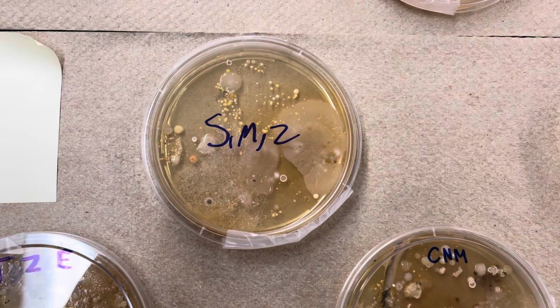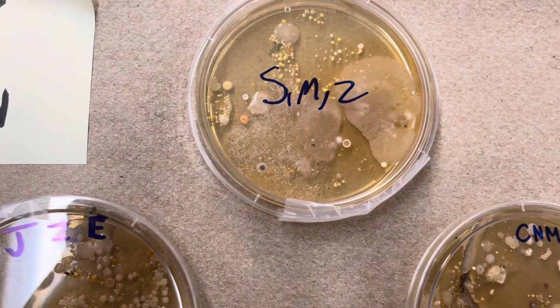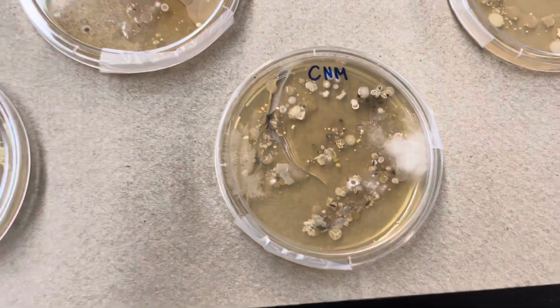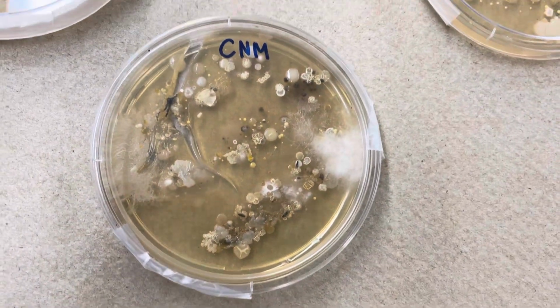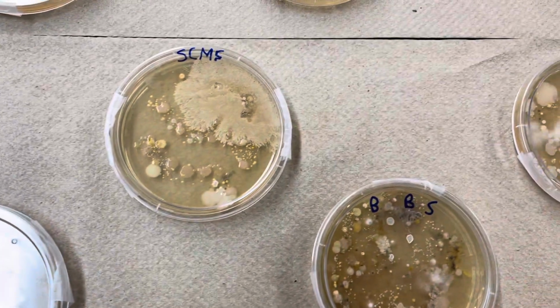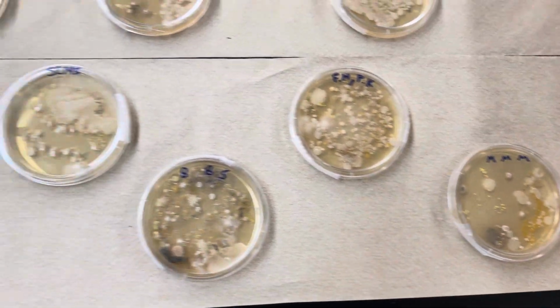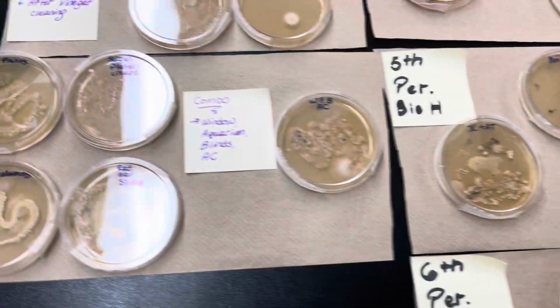And in that one, you see little yellow bacterial colonies. There's an orange one. And then, most of this is in fact different species of mold, or the fungus, once again. These guys accidentally cracked through the agar, but it's all good. Things still grew. And I always say it's a little bit like fishing in the sense that you never know what you're going to catch. You throw it out there and things grow and hopefully it looks cool. And that's what the guys kind of enjoy most of all.